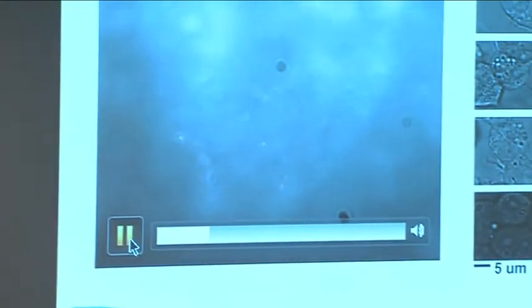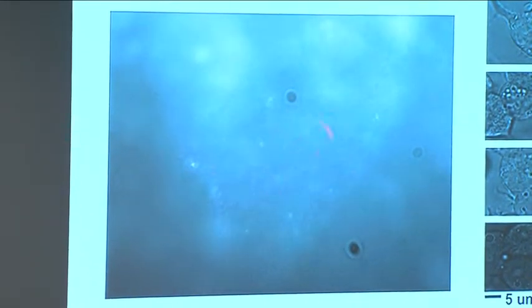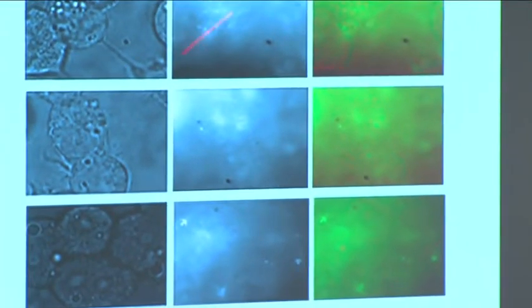You can see these quantum dots dance around, going through fairly random, Brownian-type motion, which is something we would expect, because in this case they're not targeted. They're not conjugated to any specific antibody. They're not really meant to be recruited to any specific cellular structure. But what this teaches us, a very important lesson, is that we repeated this process multiple times, so we can repetitively and reliably bring this into the PC12 cells.